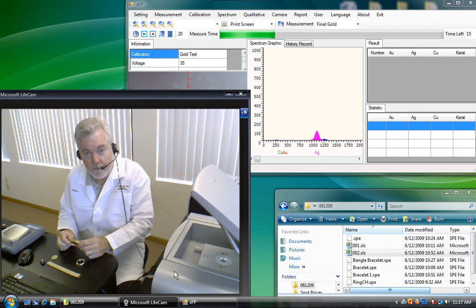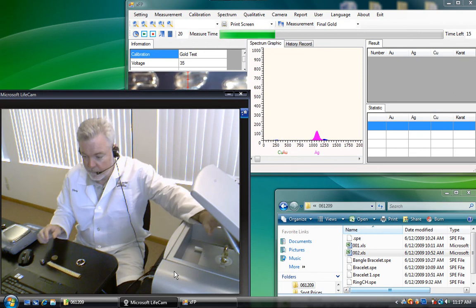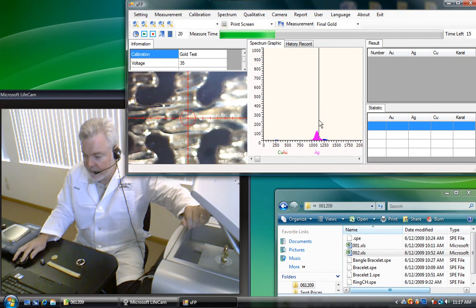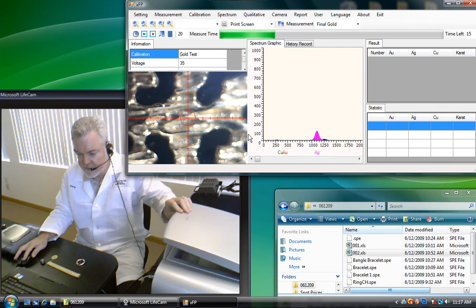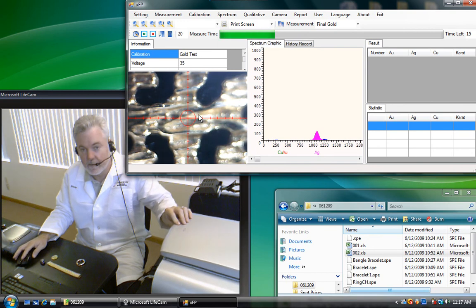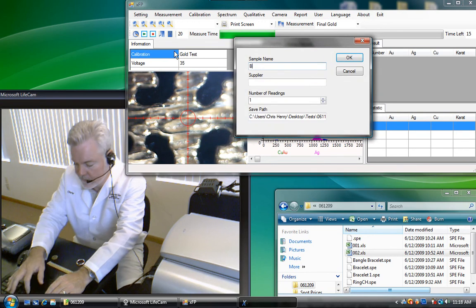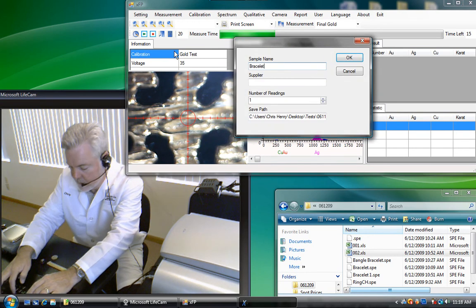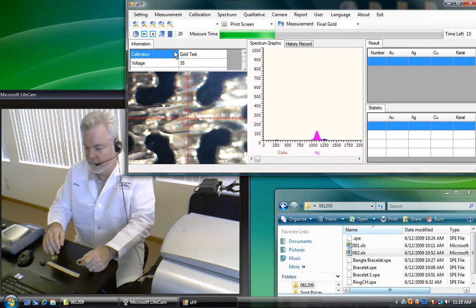Okay, so we begin the analysis process. We just take an item. We'll take this bracelet first, and we put it in our X-ray fluorescence spectrometer. There's a little picture of the item down here in the corner that helps me aim the instrument. We put it in and we go ahead and we start the test. We call it something. Just make a name, bracelet 3.